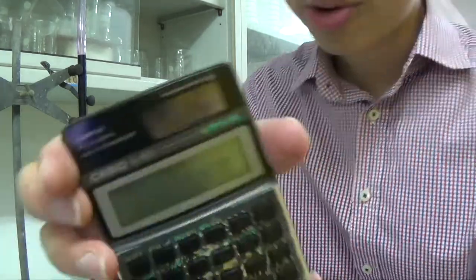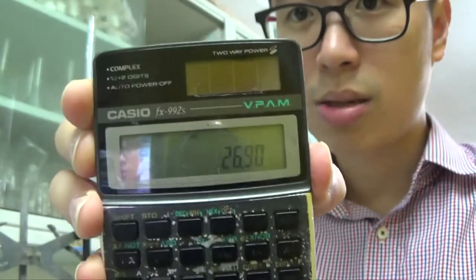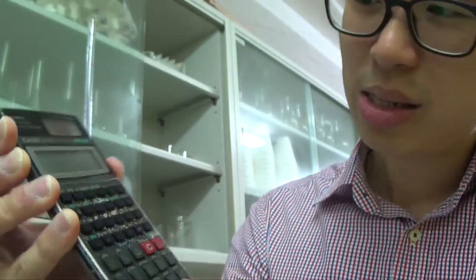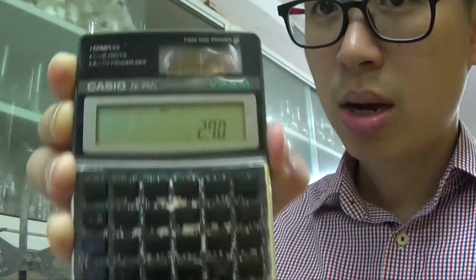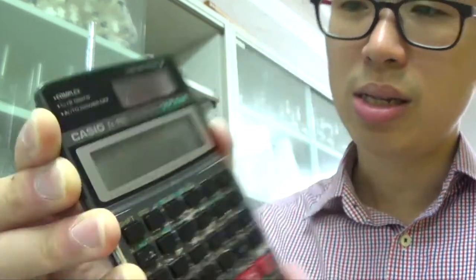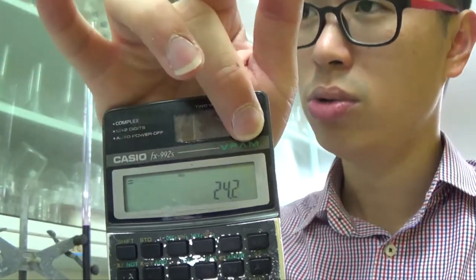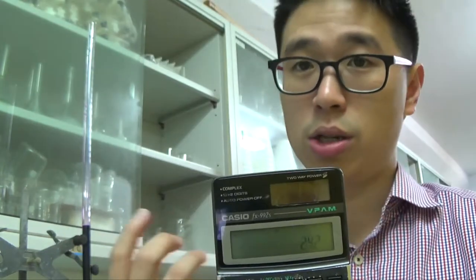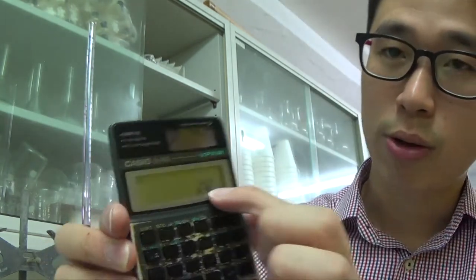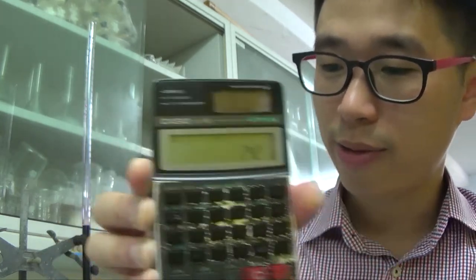So 26.90. I better show it. 26.90 minus 2.70. You record burette reading to two decimal places, all right? So that is 24.20. Your calculator shows you 24.2, but you should know about the accuracy of the burette. It is to two decimal places, and you record it to plus minus 0.05. So this is 24.20 cm³. That is your rough titre.